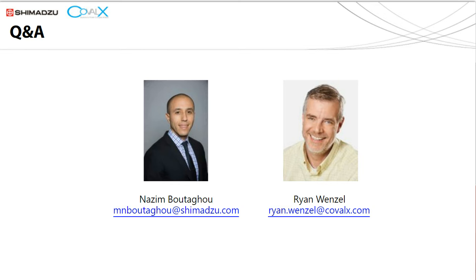As far as resolution, if you look at something like an antibody at 150,000 Daltons, typically we see a resolving power of about 100, which is going to give us the ability to fully baseline resolve about 1,000 Daltons shift up at 150,000. So resolving power of about 100 in that range. So very good, very good.